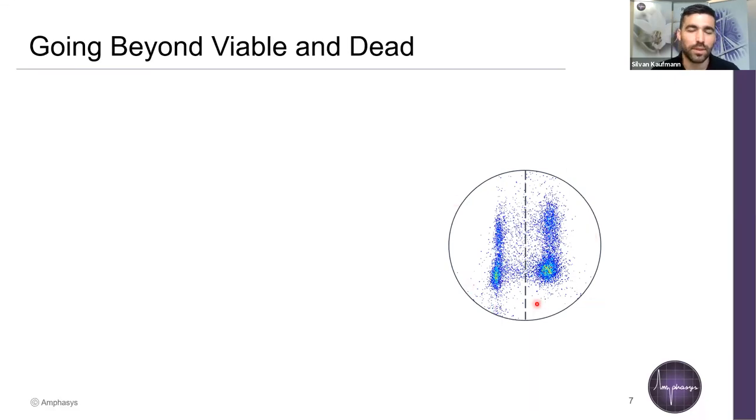Some of you may have heard it already. I just repeat it for the ones who haven't heard it yet. A typical result looks like this. We call it a scatter plot. It consists of individual points. Each point corresponds to a particle that has been measured. In our case, it would be a pollen grain that has been measured. And those points form certain clouds or clusters.